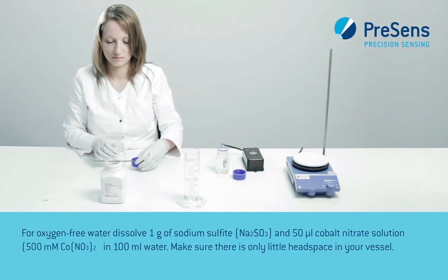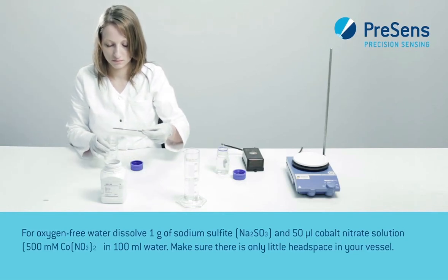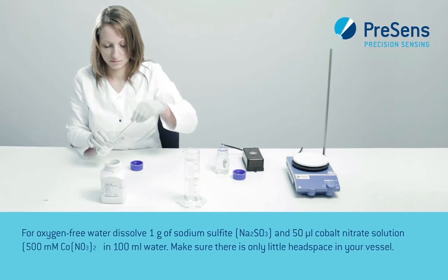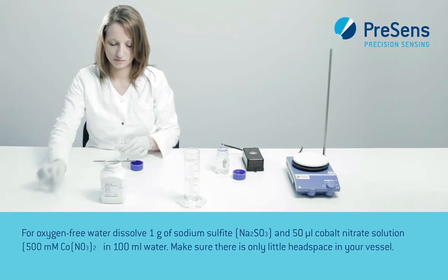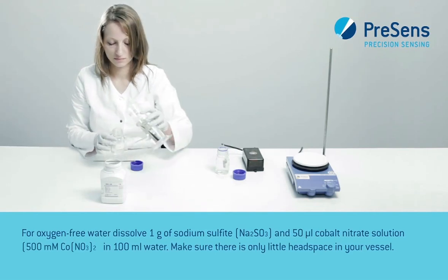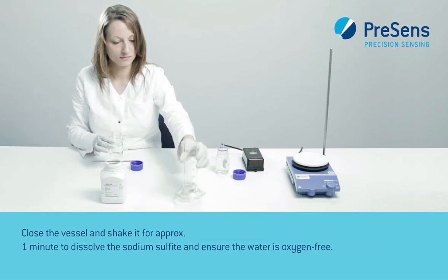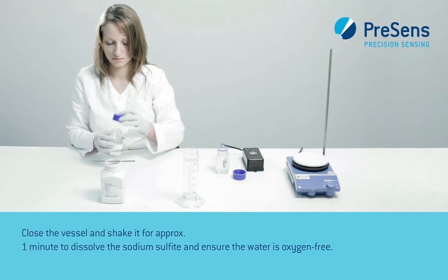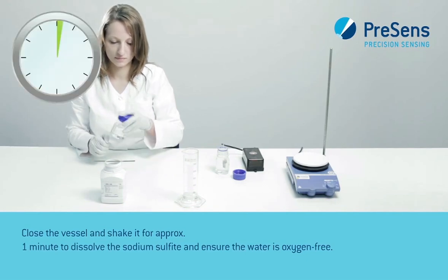For oxygen-free water, dissolve 1 gram of sodium sulfite and 50 microliter cobalt nitrate solution in 100 milliliter water. Make sure there is only little head space in your vessel. Close the vessel and shake it for approximately one minute to dissolve the sodium sulfite and ensure the water is oxygen-free.